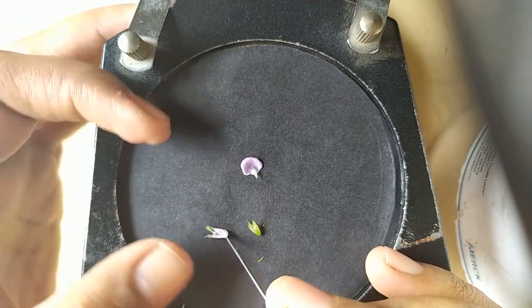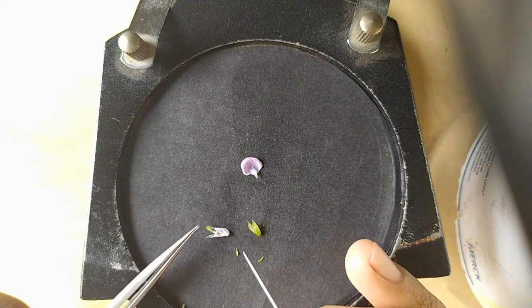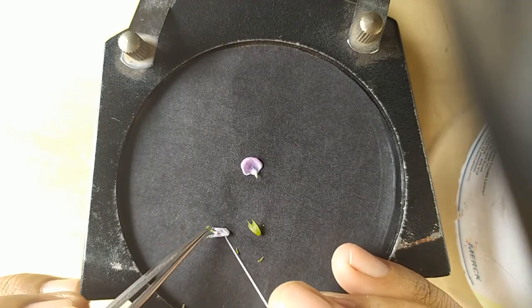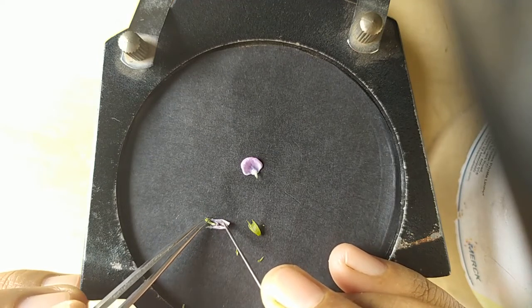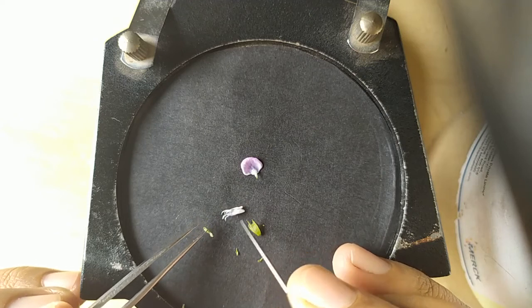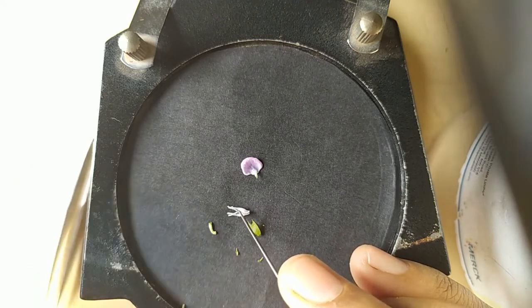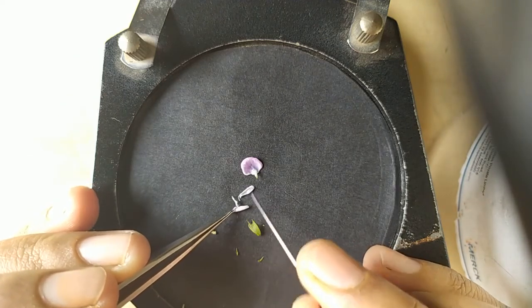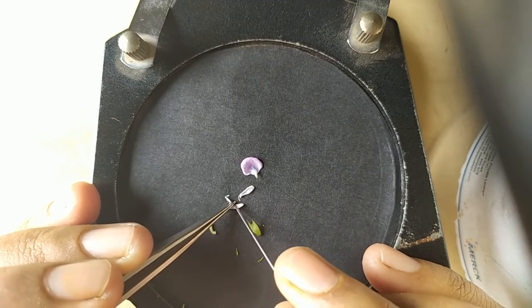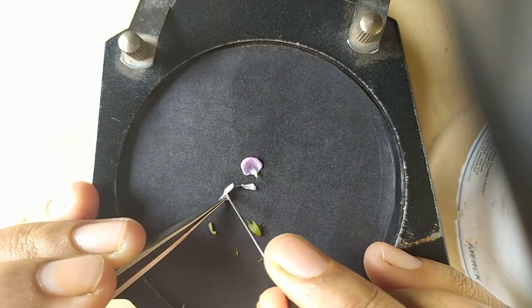Okay, then remove. Very nice. Then this one is the wings, and the innermost two petals are the keels.